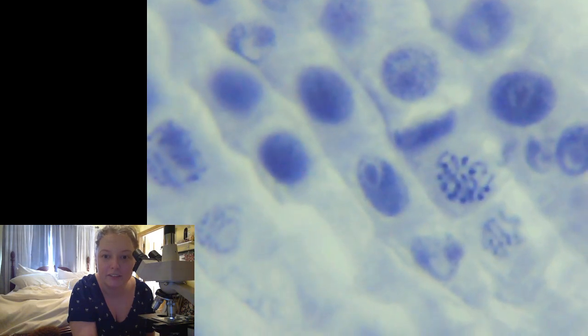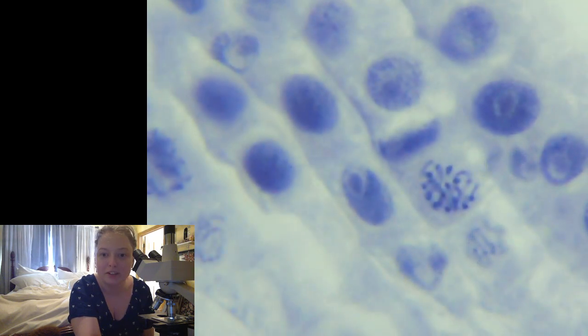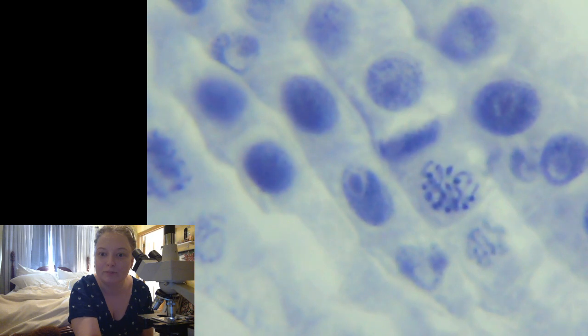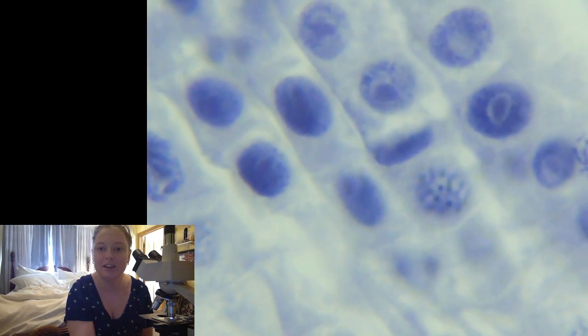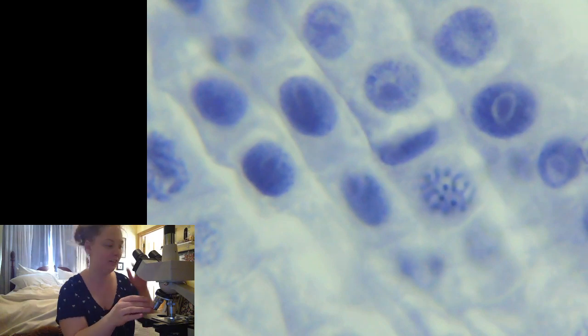Kind of to the right of the screen is really neat. And what's cool too is they're 3D, so you can zoom kind of through the cell a little bit. You can see, you know, this is kind of the top, and then through the middle, and then through the bottom. So I just thought that one might be kind of interesting to us because we had just done some mitosis. So let's pull back out of there, get ourselves reset.